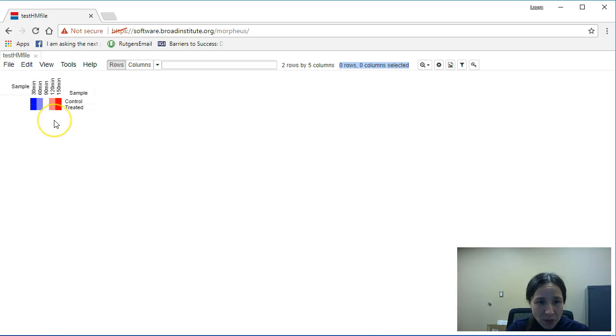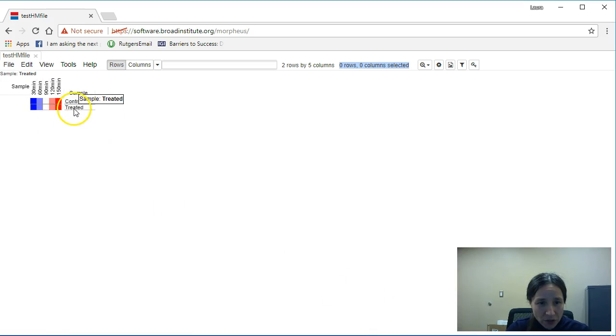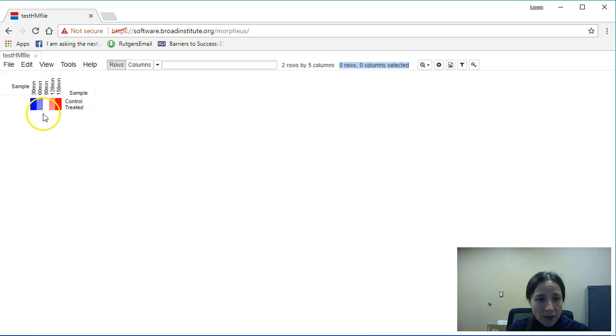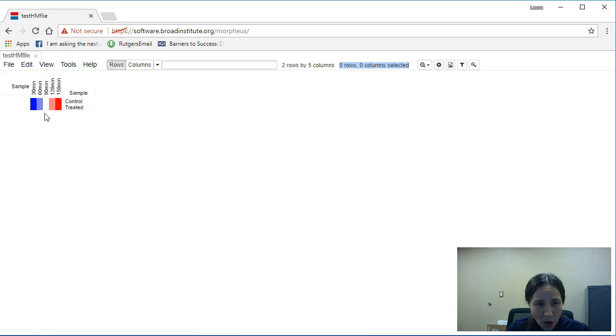And you notice we have a heat map. Now you'll notice that both my control and my treated rows look the same. Why is that?